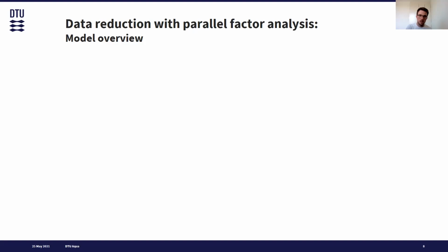But overall, we started by fitting 2 components and went all the way to 10 components. And to our surprise, after 5 components, we started seeing more analytical variability. So slight changes in the way that the mass spectrometer responded to the elution, or that the elution was not completely reproducible between samples. We could start seeing these artifacts after 5 components. So we chose to go with a 5-component model, a surprisingly low number that didn't quite fit with our expectations. And I'm going to talk about this 5-component model now.